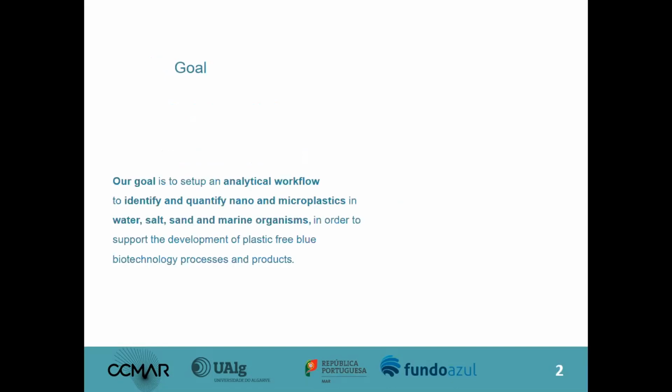So the goal of the project is to set up an analytical workflow to identify and quantify nano and microplastics in water, salt, sand, and marine organisms in order to support the development of plastic-free blue biotechnology processes and products. And why this analytical workflow? Because there is no single method that can be used to analyze microplastics. Usually we need different methods to get the information we are looking for.